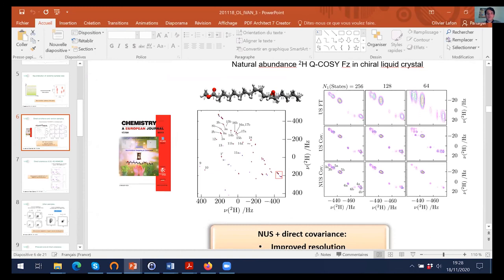There, of course, are many different ways of doing non-uniform sampling, and I'm sure that in the January presentation, they'll discuss whether you sample on a grid or at truly random points. It's much easier to just sample on a grid, but I don't know if there are advantages for covariance. In certain other reconstruction techniques, there are advantages to really sampling at random and not sampling on grid points. Yeah, and certainly for covariance, we don't care at all. So that's totally true.